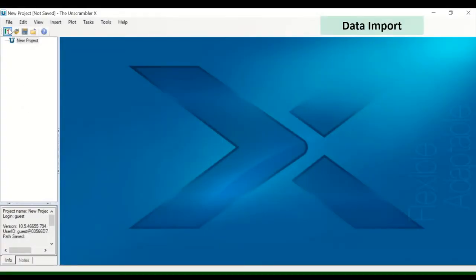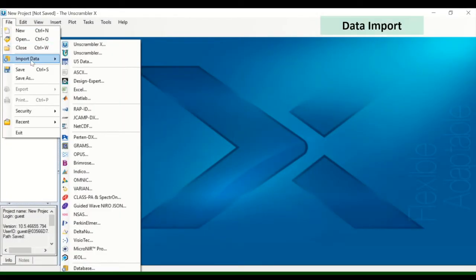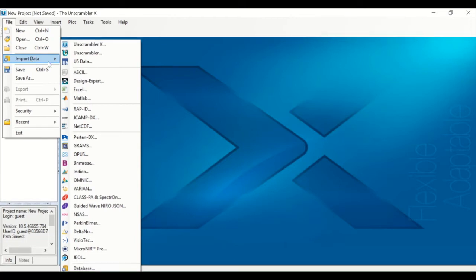To get data into Unscrambler, go to File Import Data. A variety of file formats can be imported into the Unscrambler.